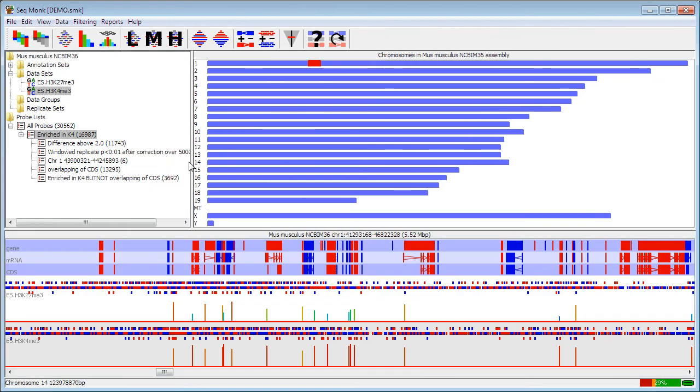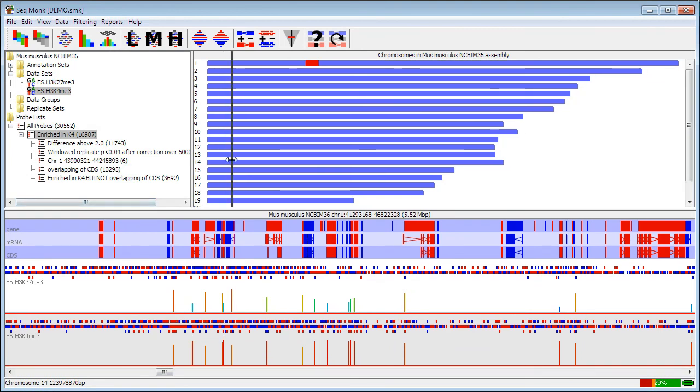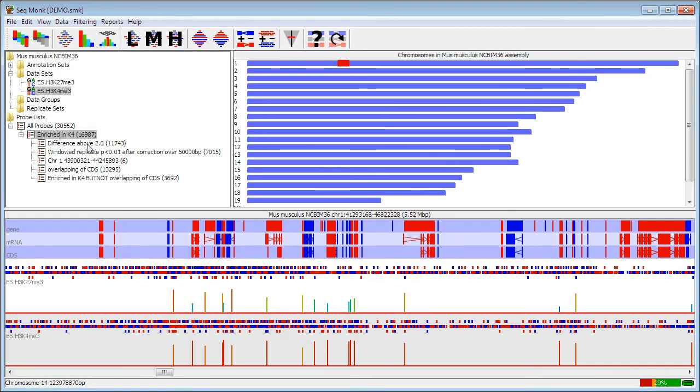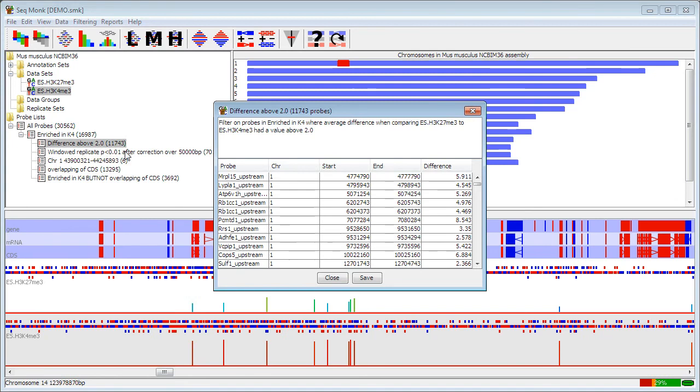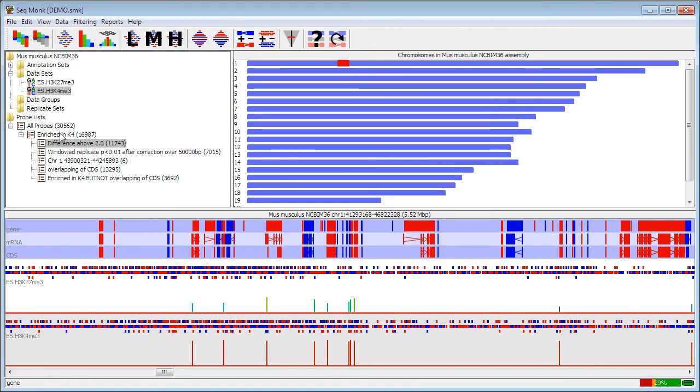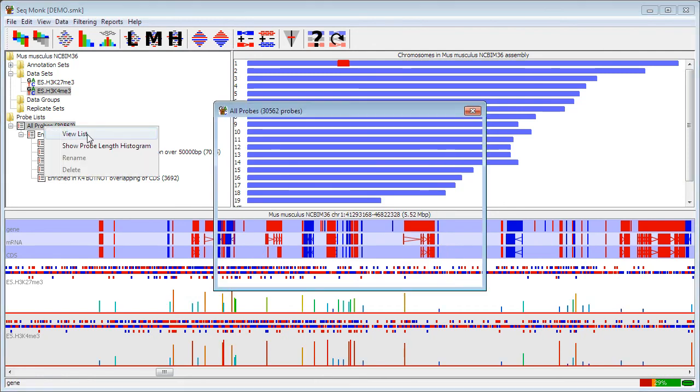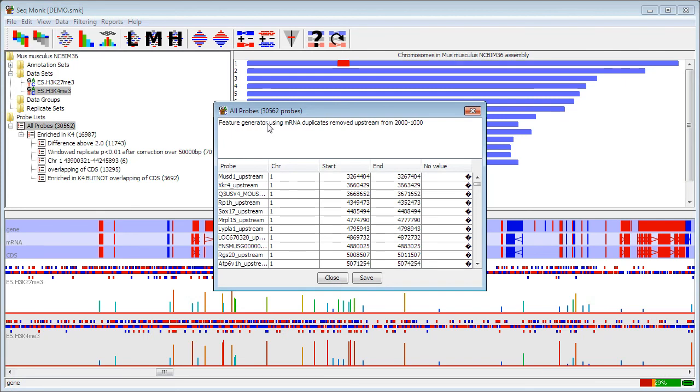All of your probe lists will appear in the data window over here. Each probe list will have the name that was associated with it, either the one you supplied or the default name that was given to it, and the number of probes that are present in that list. If you're ever not sure about the conditions you used to create a probe list, you can right-mouse-click on the list and say view list, and as well as producing a list of the hits that you got, there will be a description at the top that tells you the exact parameters that were used to define that probe list in the first place. If you do the same thing on the all probes list at the top and view list, what you'll see at the top is the parameters used for the probe generator right at the start when you first generated your probe set.